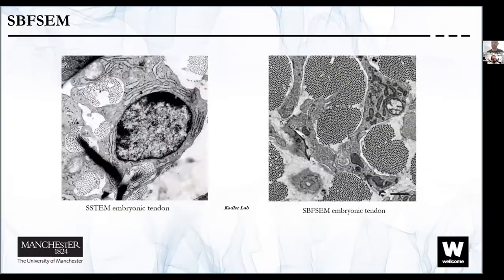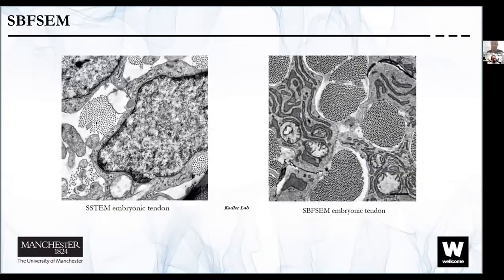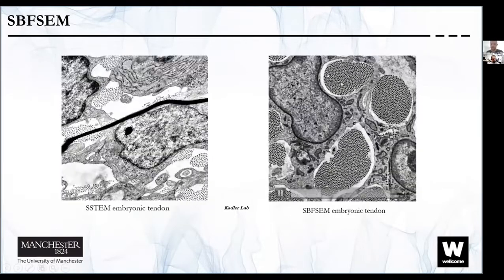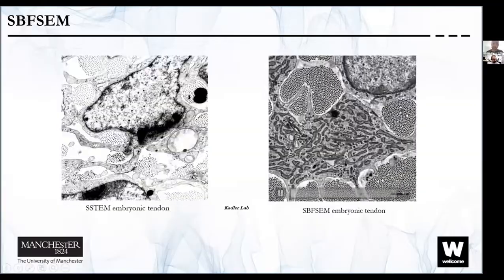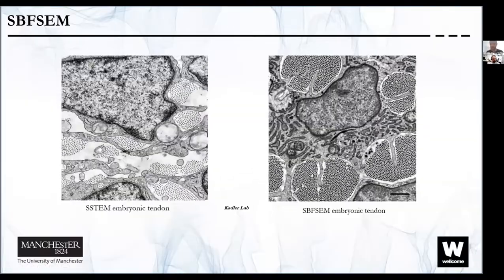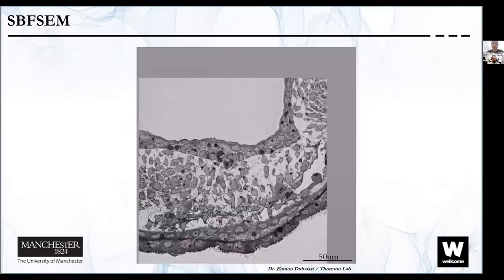The images are much more well aligned. The resolution is still really good by a lot of standards. You can see the collagen fibrils really easily, the cristae of the mitochondria, etc. The resolution isn't quite as high, but it's important to know that for a lot of applications, this resolution is more than enough, much more than enough in a lot of cases.